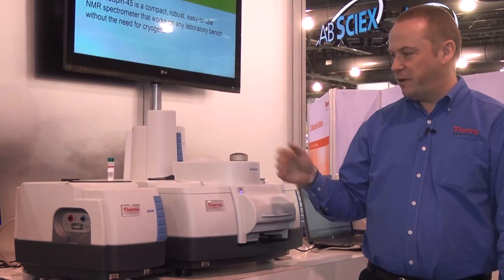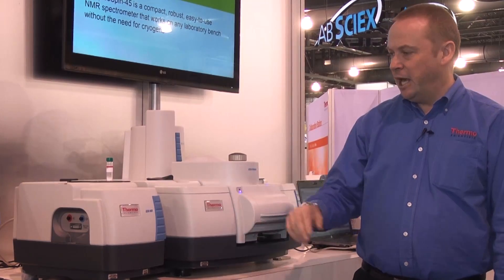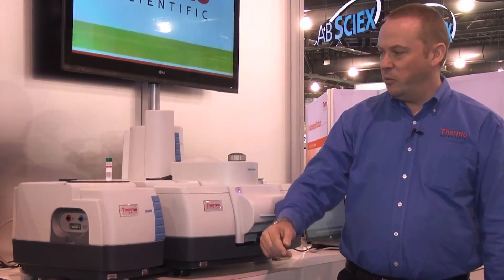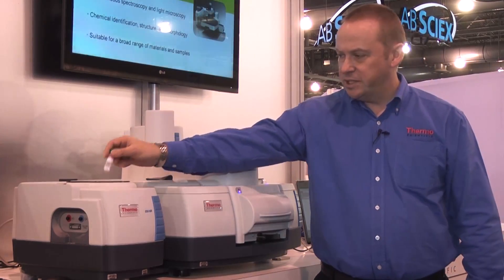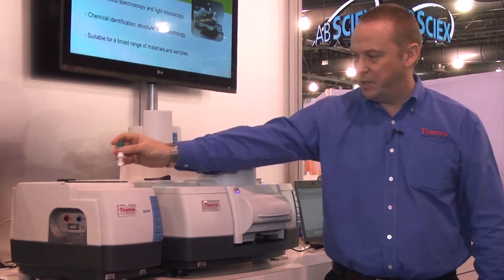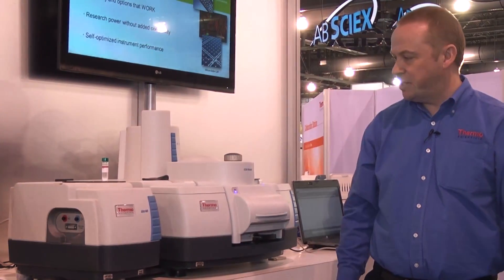The system we have here is a very well equipped system. We have a near-infrared module over here, which is a great choice if you're wanting to do quality control on powdered samples such as these — simply place the vial on top of the sphere there and obtain the spectrum.